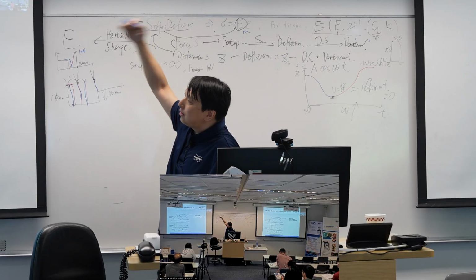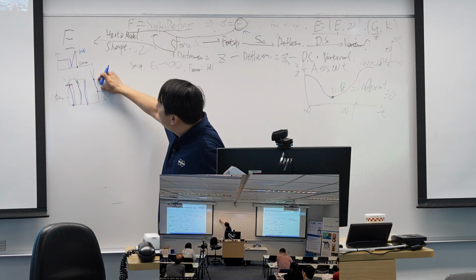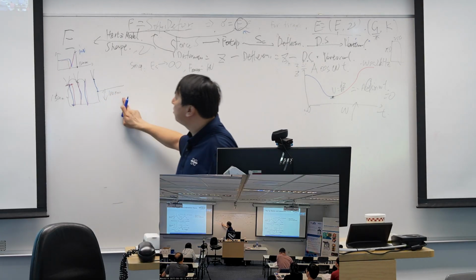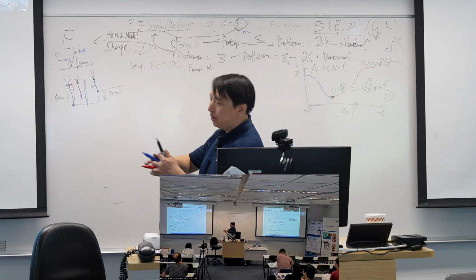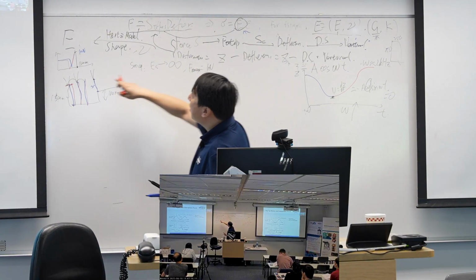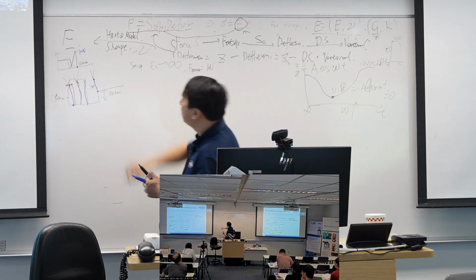It reached the second step, so the distance of the blue curve is only 150 minus 100. It's only 50 nanometers. And it reaches 1 nanonewton, and then the probe will go up. It will go up as I set up. It will travel 150 nanometers.